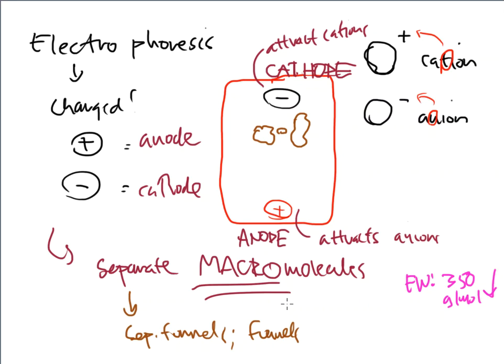This electrophoresis is simply a separation process. That's all that it's going to do. Nothing reaction-wise, nothing of making a new product, calculating your theoretical yield and your percent yield. That's not what's happening in electrophoresis. It is simply separation. That separation has to take place, but with very large molecular weight compounds. And when I say molecular weights or formula weights here, folks, we are very often talking about 100,000 grams per mole or larger. That's how big these things are.